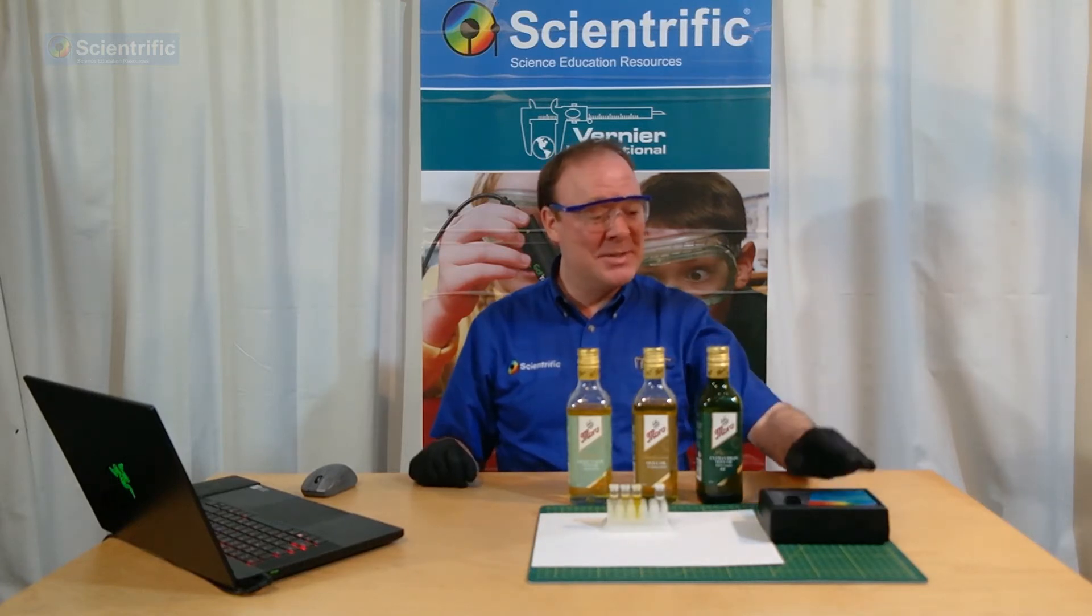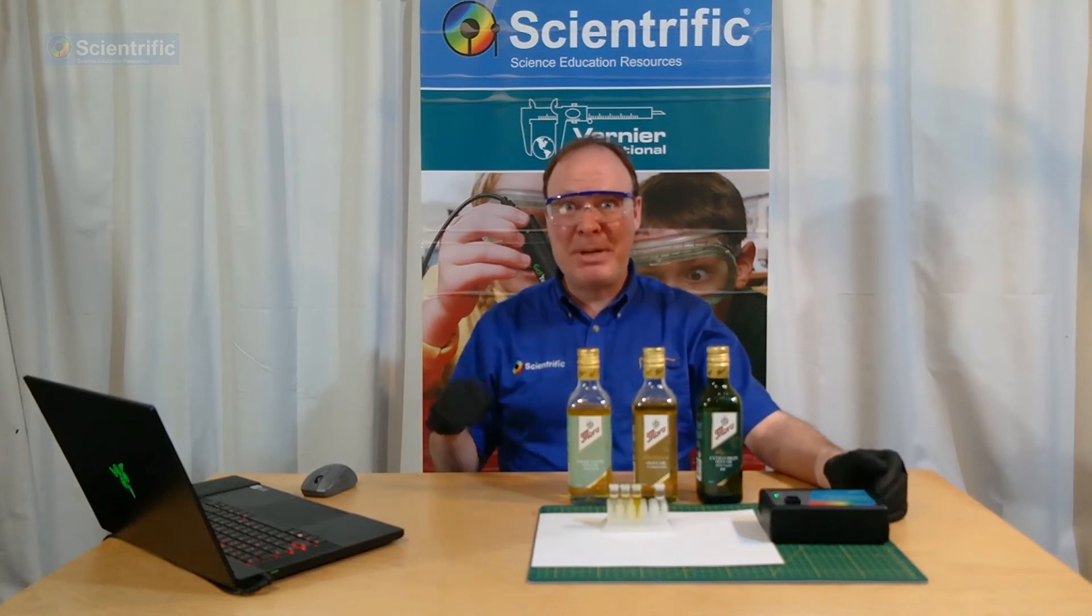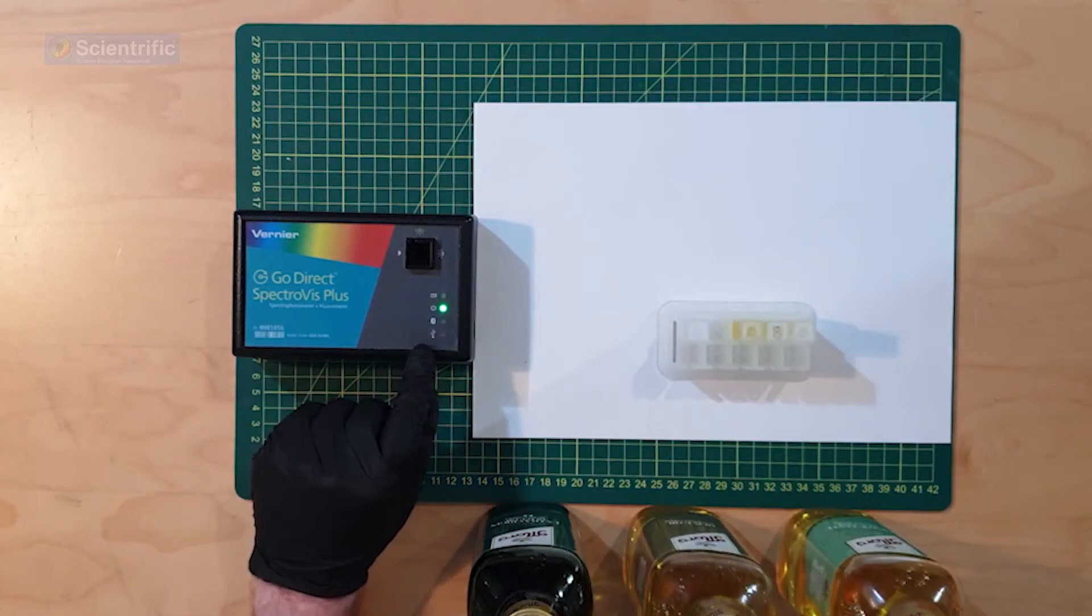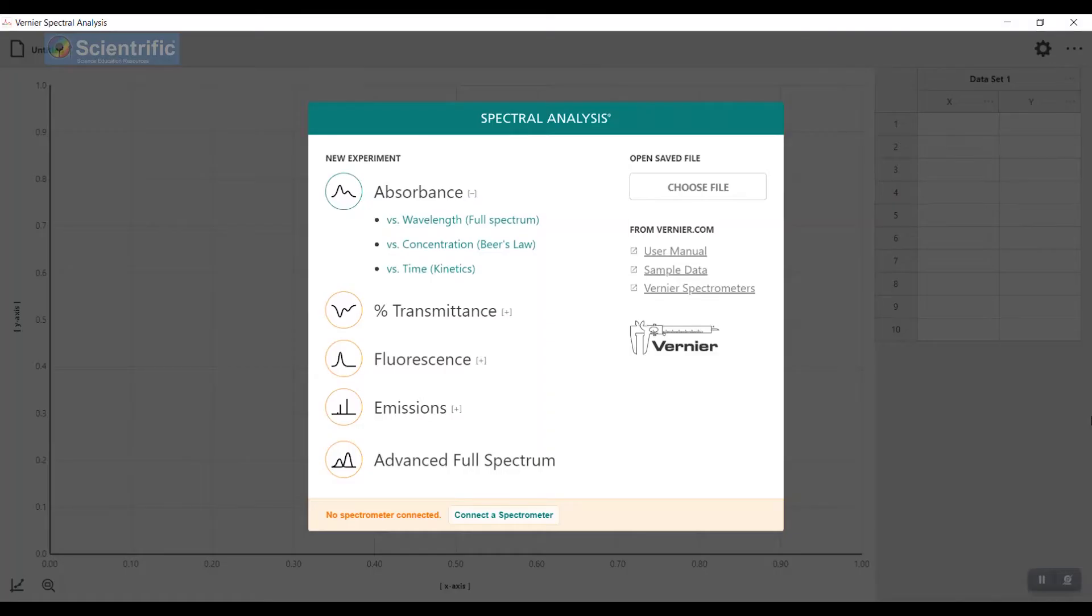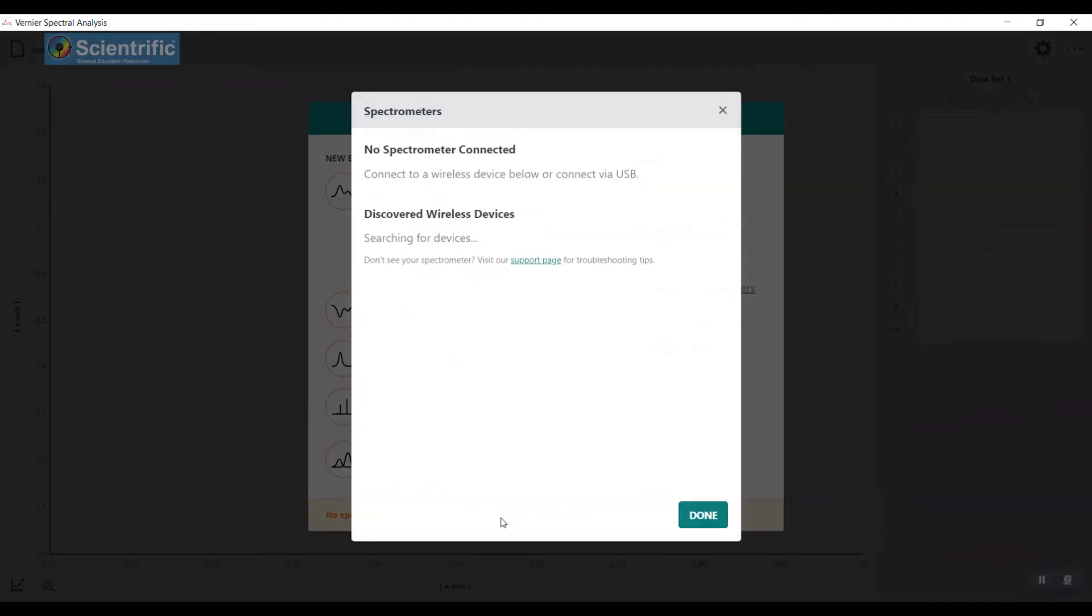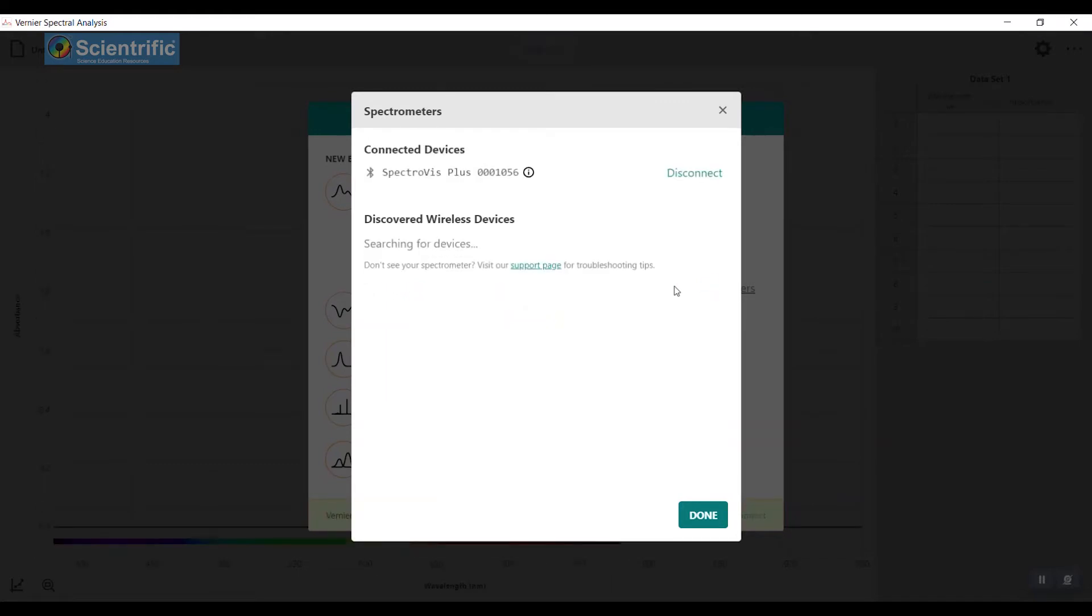I'll connect the spectrophotometer to Spectral Analysis to begin with. The blue light's flashing, which means it's sending out the Bluetooth signal. On Spectral Analysis, I'll go to connect a spectrophotometer. Now that it's connected, I'll go to done.